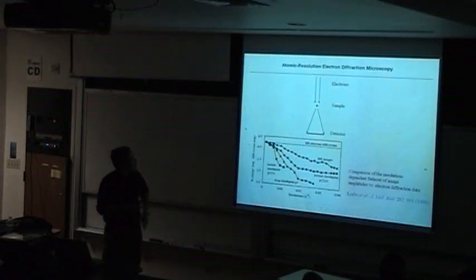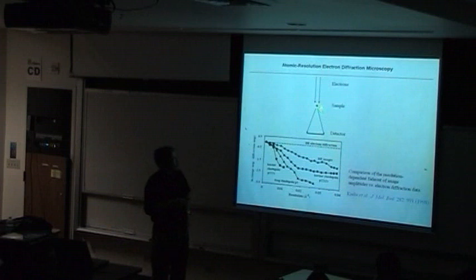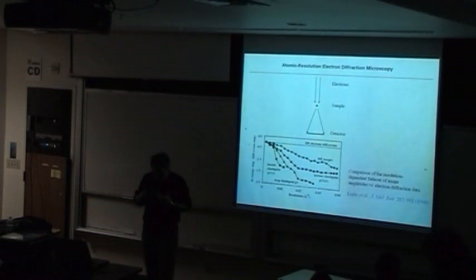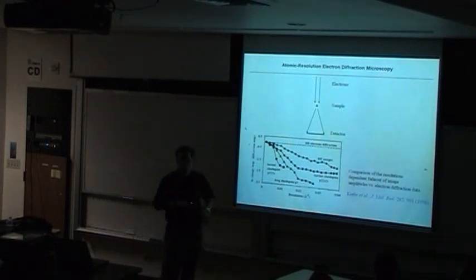And finally, I'm going to talk about how this can also be applied to electron devices. So you may ask, why electrons? The electron can get very high resolution. Right now, you can get 1 angstrom resolution. The advantage is that diffraction is a more efficient method.